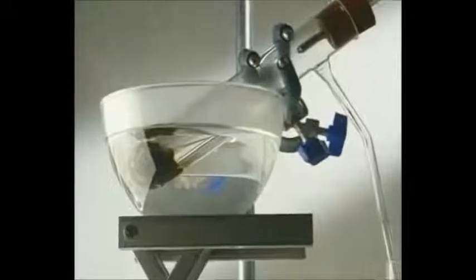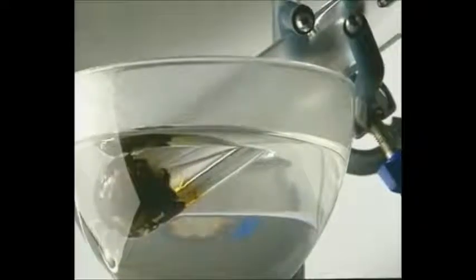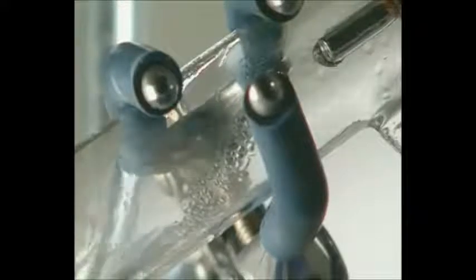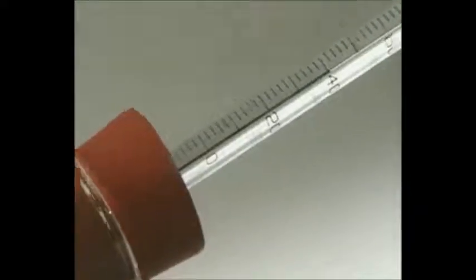The hydrocarbons with lower boiling points begin to vaporise immediately. They're flammable, so it's safer not to heat with a naked flame. As the vapour rises, it enters the sidearm, where it cools and condenses. This happens at about 40 Celsius.